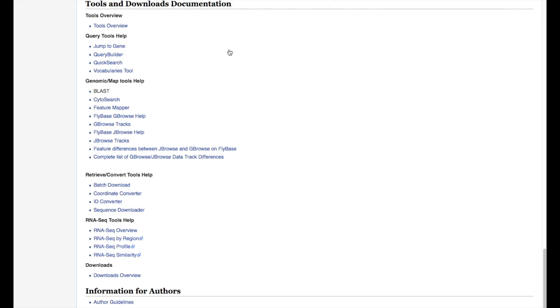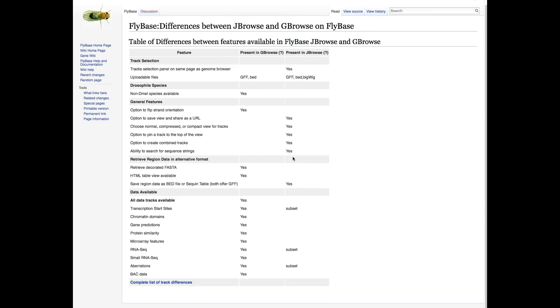You can find useful information about these genome browsers in the help documentation. This includes information not only about the browsers themselves, but also information about available tracks and a description of the differences between GBrowse and JBrowse.